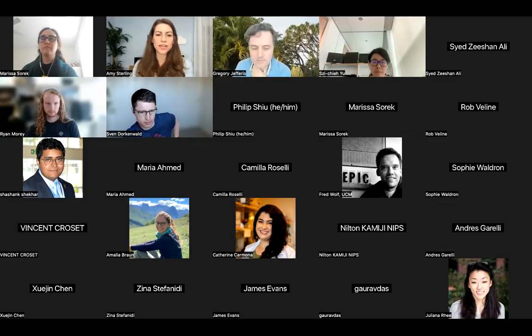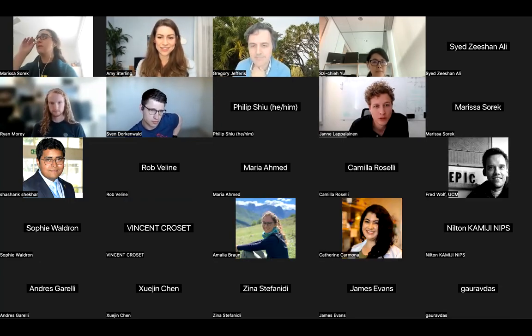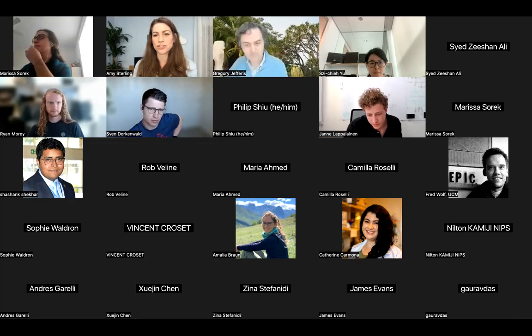Do we have any questions from any attendees? Looks like we just got one, Amy, in the Q&A here. About the Gal4 line table: where a Gal4 line labels multiple neurons, can we use that information to search for neurons?